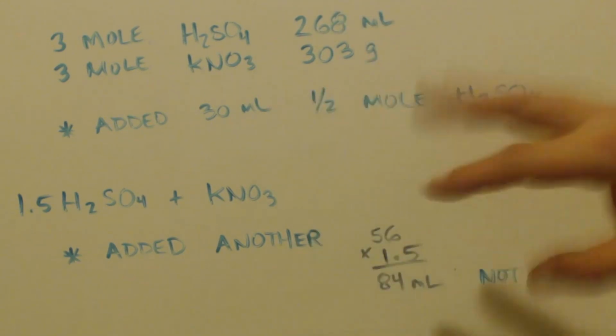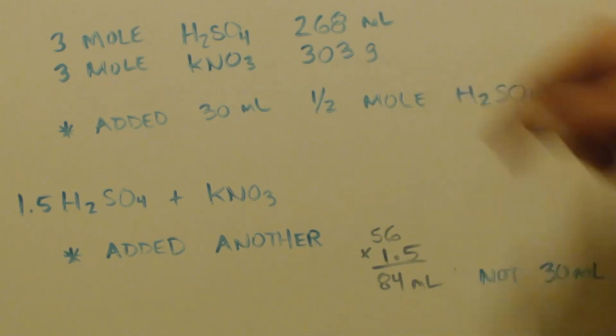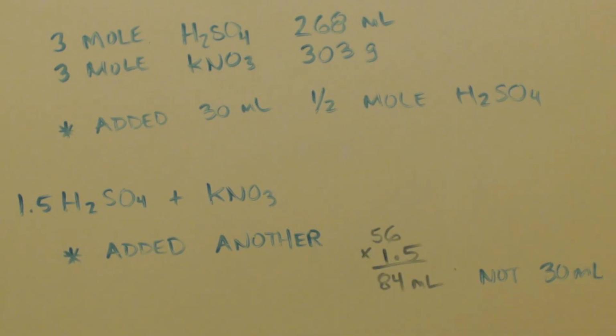I added in 30, thinking I already added it in, right? Thinking, oh, I'll figure out what happens if I put even more acid in. I never put the 84 in to begin with, okay? I only put 30 in, and therefore I didn't even figure out how much I have there. I know it's not 93%, although it might be 90% or something, 85. But I didn't put all the acid in that I needed. That's another 54 milliliters I should have added, you know what I mean?